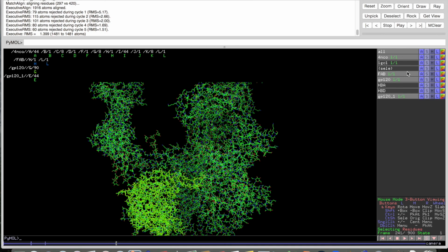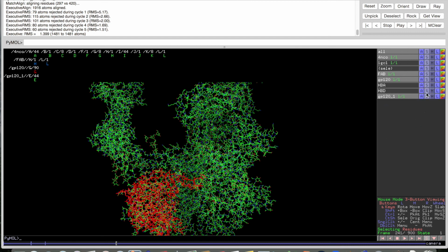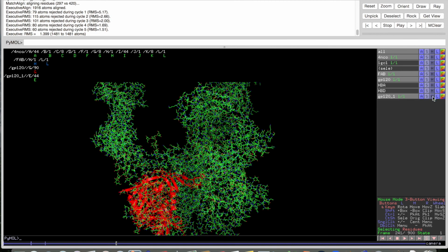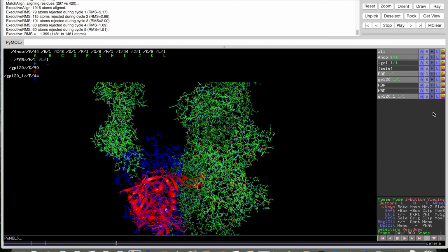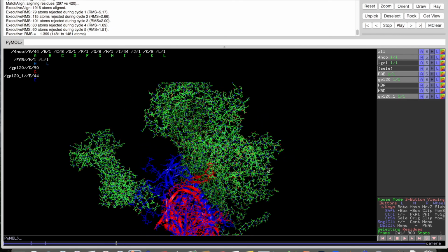So let me change the color of GP120 to red. Perfect. Let's make it a cartoon. And GP120, let's make that blue. Also a cartoon.